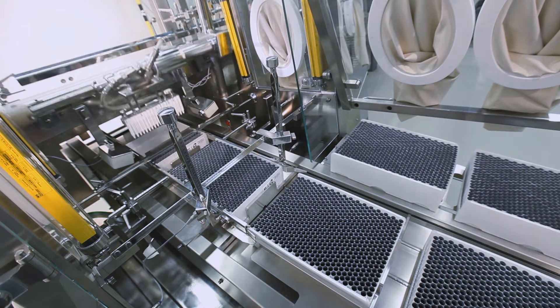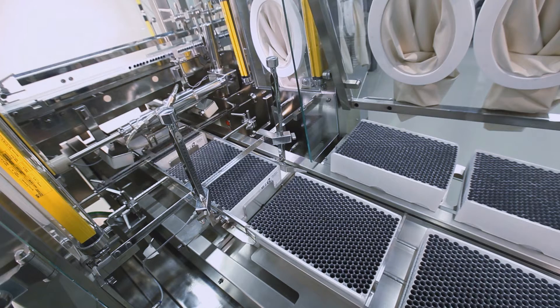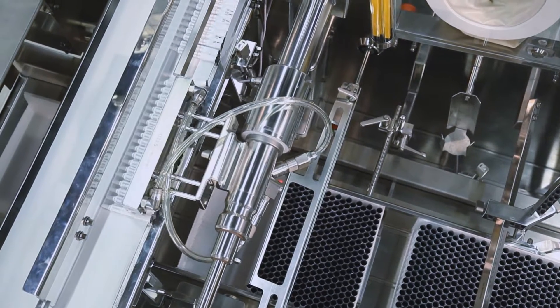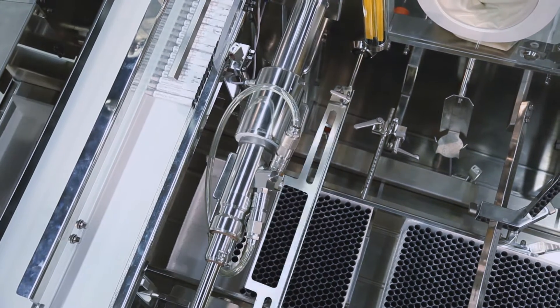The tube filler is completely designed according to the actual EHEDG hygienic regulations for machines in sterile environments. The focus during construction of the machine was on user-friendly access and machine cleanability.